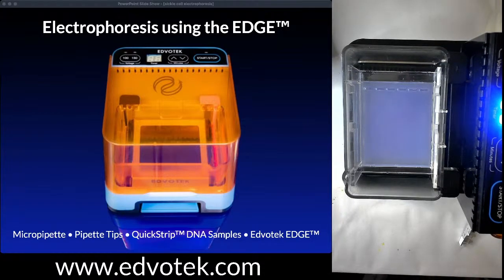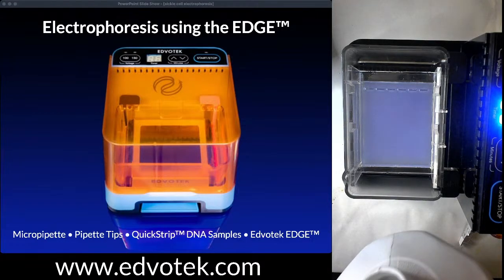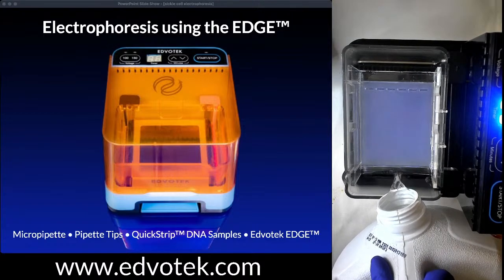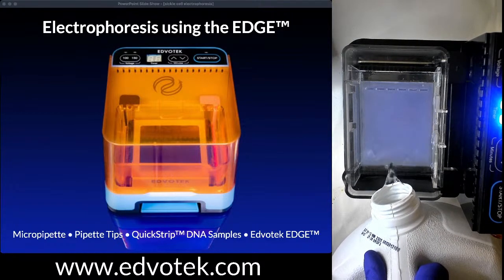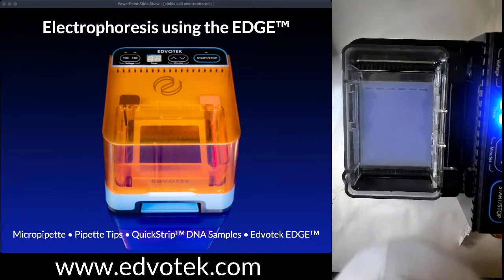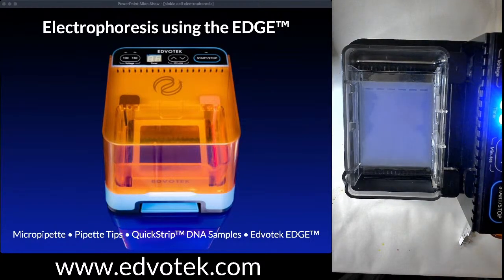The electrophoresis buffer, which I'm going to add, I have pre-diluted. It's a mixture of buffers and salts. And again, there are going to be two reasons why we use this TAE electrophoresis buffer. Some kits use TBE. It's a different system, but the basic biology is the same.